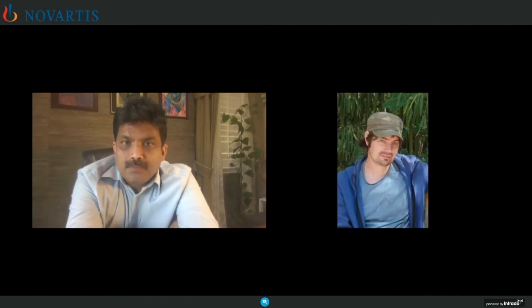I think we really need the crystals. We work on nsp16, I think it was the 16/10 complex, and we did get some crystals, although they did diffract, but they've never really been used for fragment work as I understand it. And we're also looking at nsp14. We've got some early days structure of that on its own, and if we can optimize the crystals a little bit, we might be able to take that down this road as well.